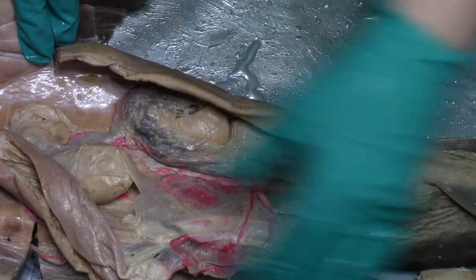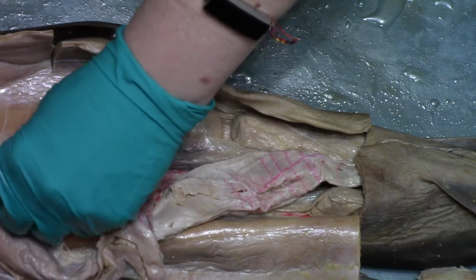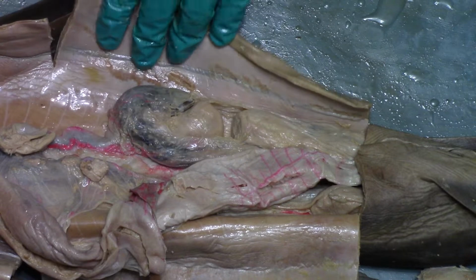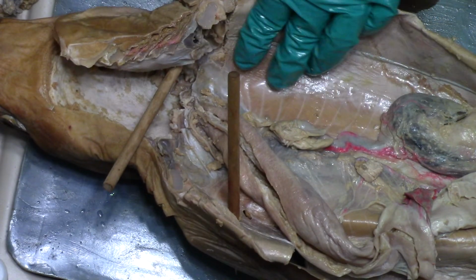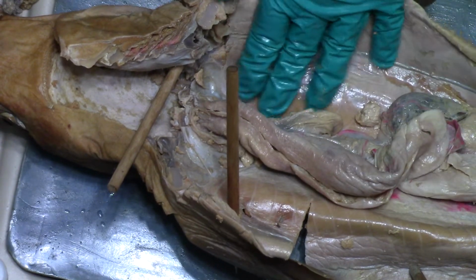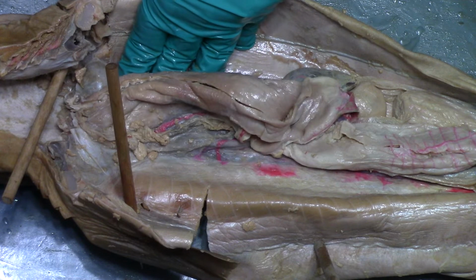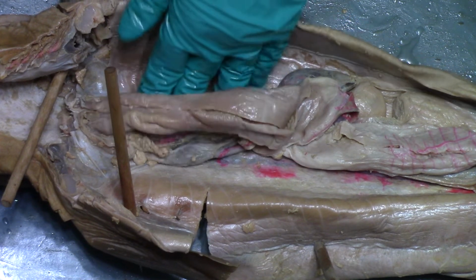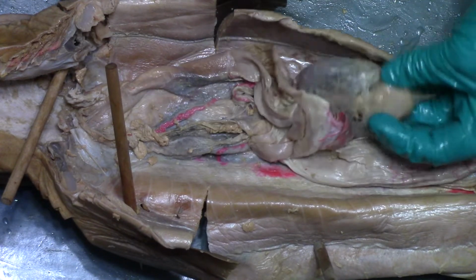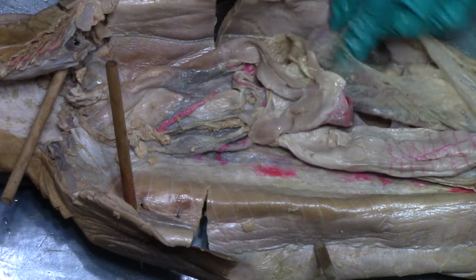1, 2, 3, 4, 5. And there's more down here too. So you can see how we're all the way up at the head up here, and we had eggs right up here, right where the esophagus was. And in a male, that's where the testes are. The testes are right up here. Oh, I wonder if those are ovaries, not eggs. And that's why they are right up there. But they're all the way down here, too. Like, they feel more like they ought to be eggs, not ovaries.